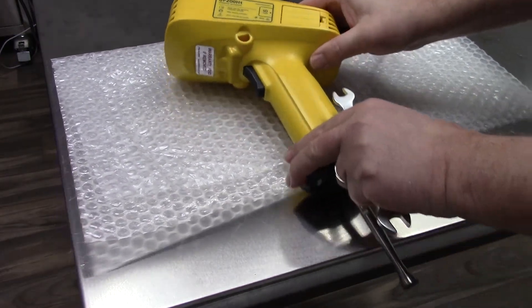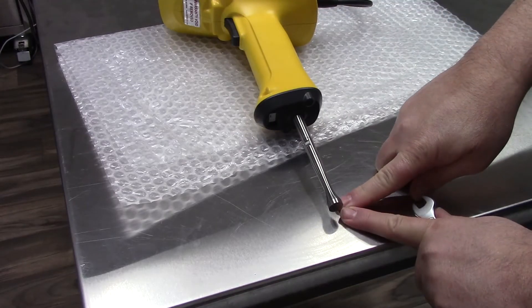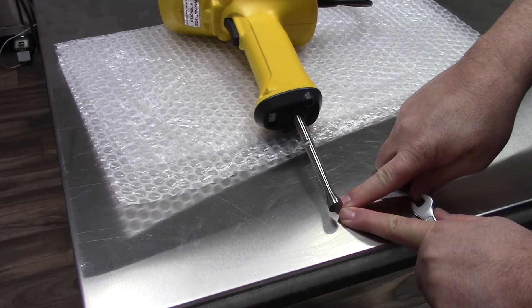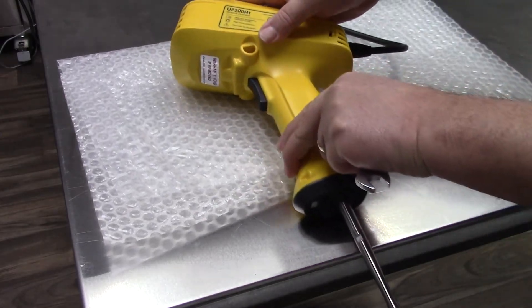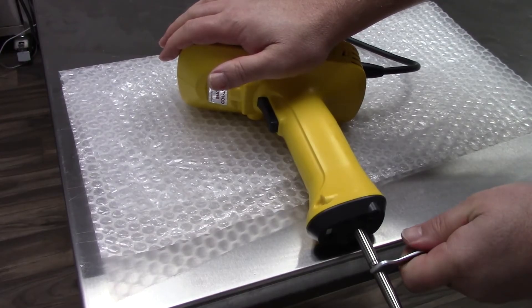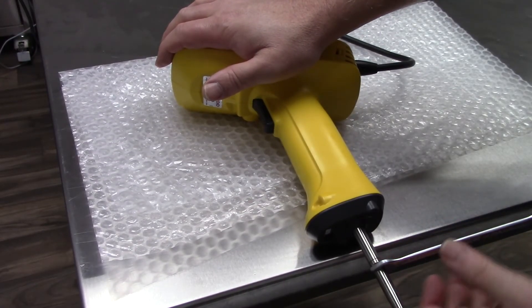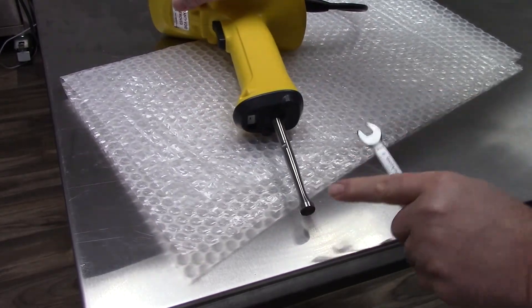Please be mindful — do not crush the tip of your sonotrode on the table. That's why I moved it to the side; it allowed me to use the table and the open space to not destroy the tip of the sonotrode.